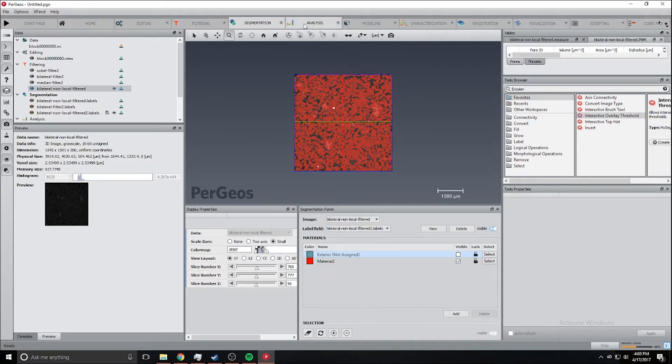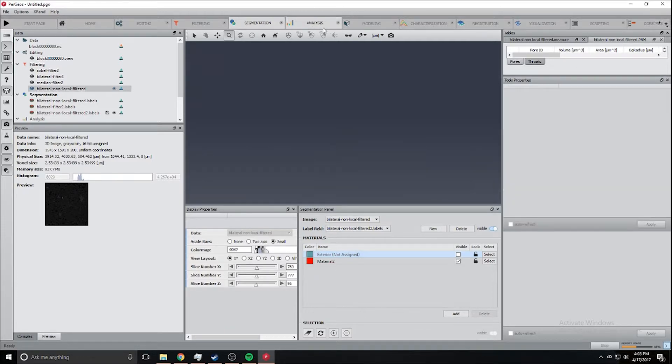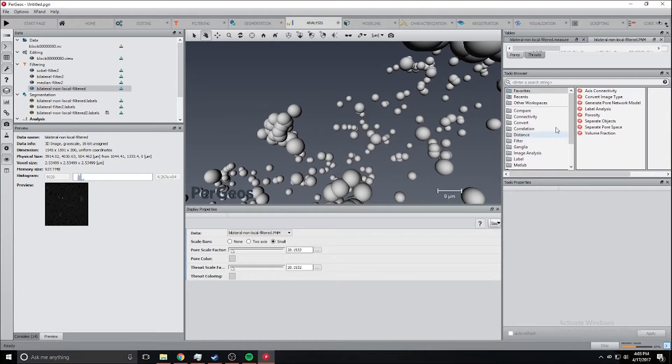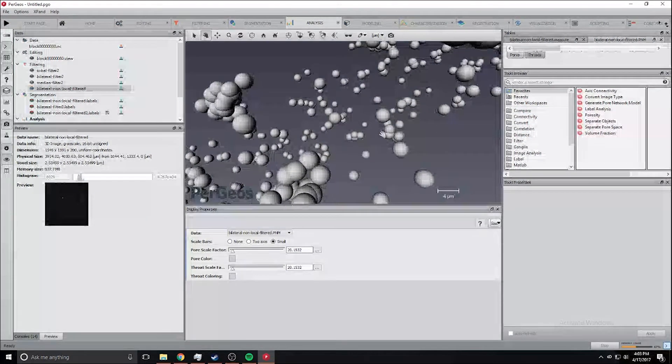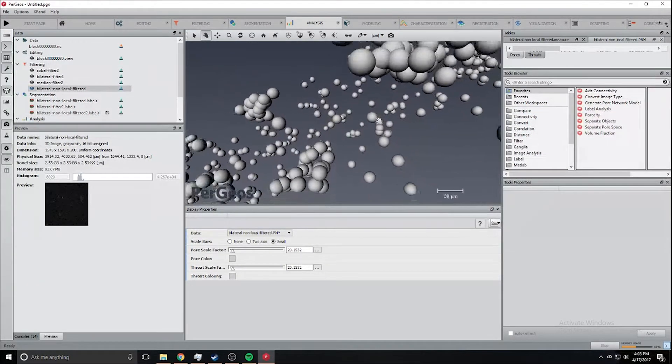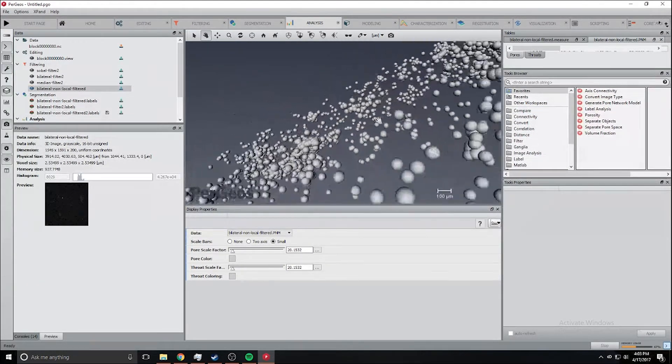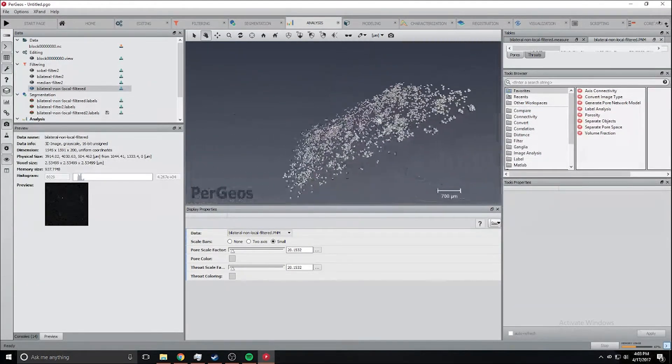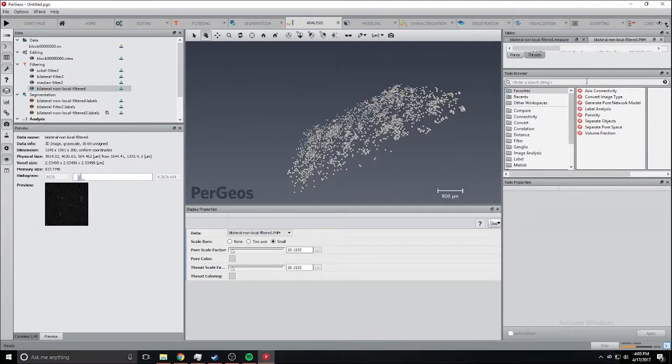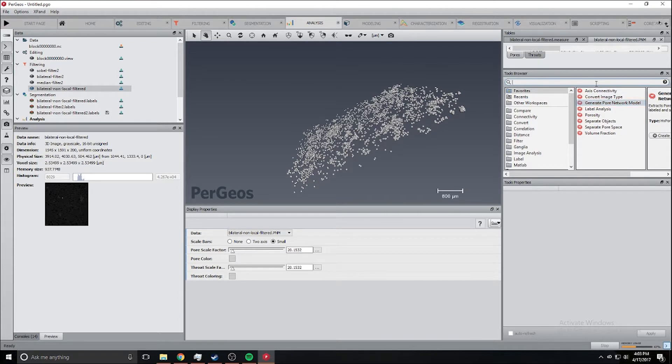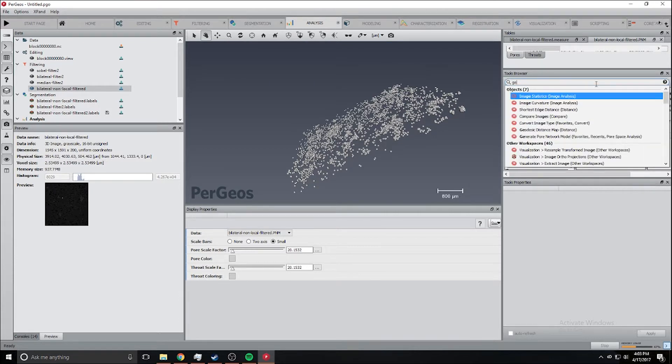This is a model of where all the pores are in the model. To do this you just go to generate pore network model and search that here.